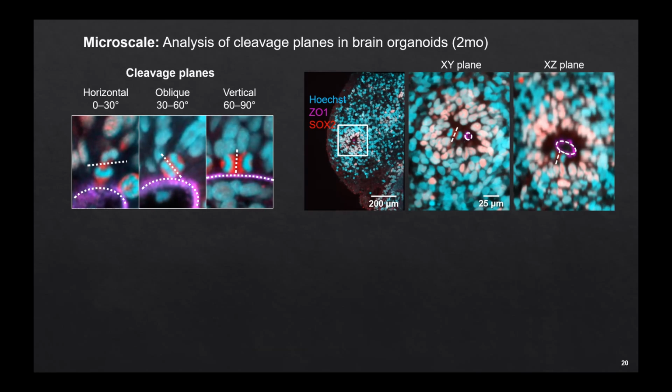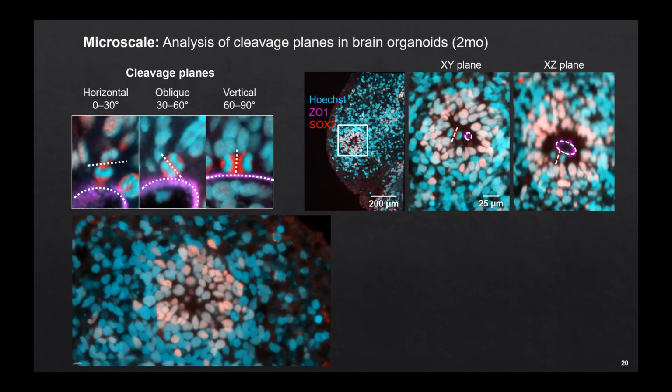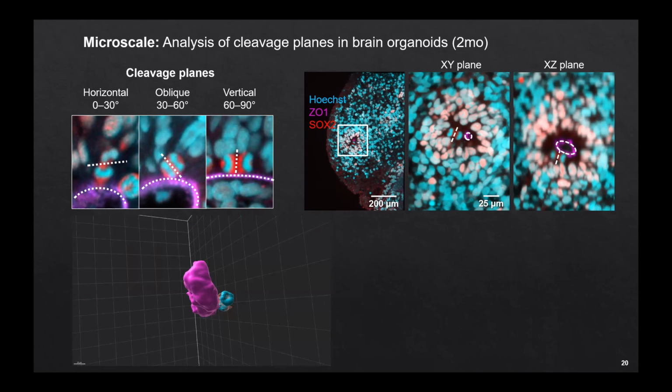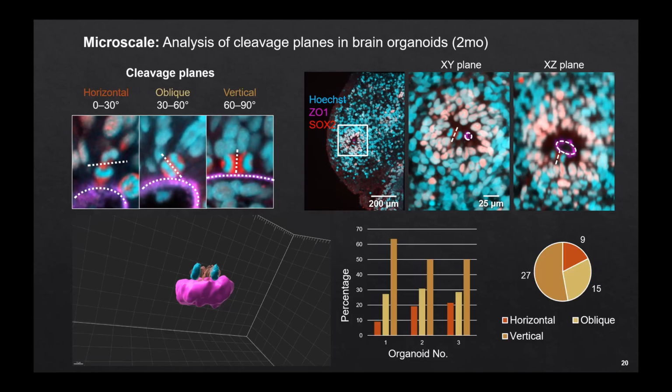So that's why it's also important for us to preserve the complete 3D information in order to then focus on a small region of interest and with a better resolution, either by having a better objective or by having the same, let's say 4x objective, but expanding the sample 4 times. We are able to get information like this, the complete 3D information. Of course, we did the validation of this cleavage plane for the corresponding organoid.